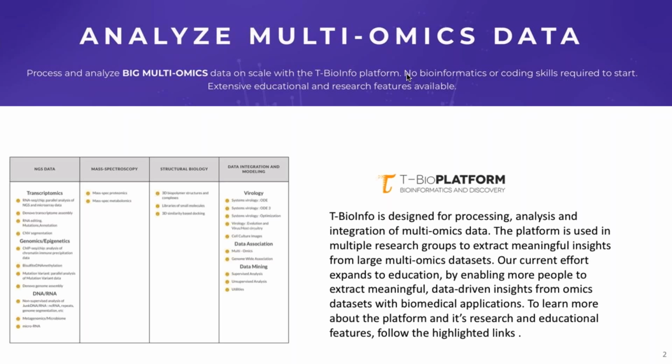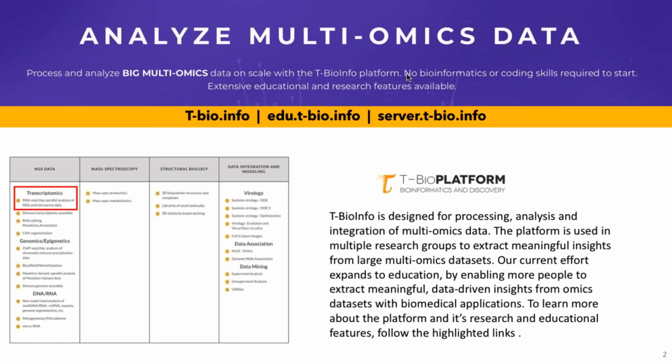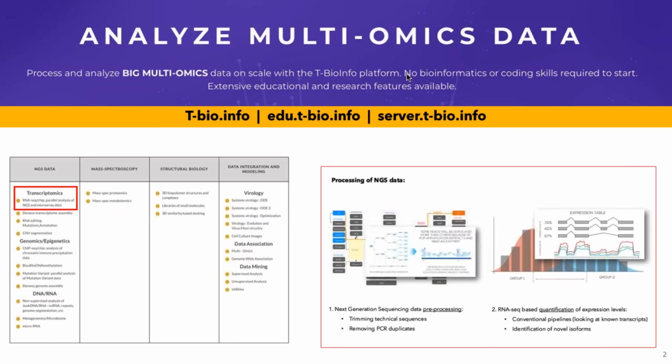You will see that on the platform there are many different sections and many different data types. Today, we will focus on transcriptomics, so the section that will allow us to process raw RNA-Seq data, and also to establish some differences within the data, such as differential gene expression on quantified mapped reads.